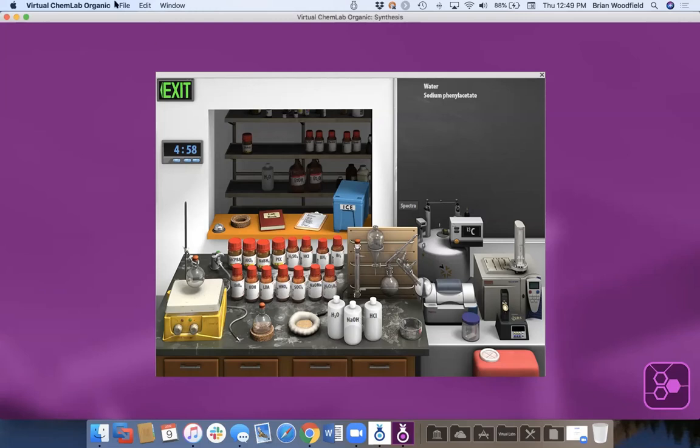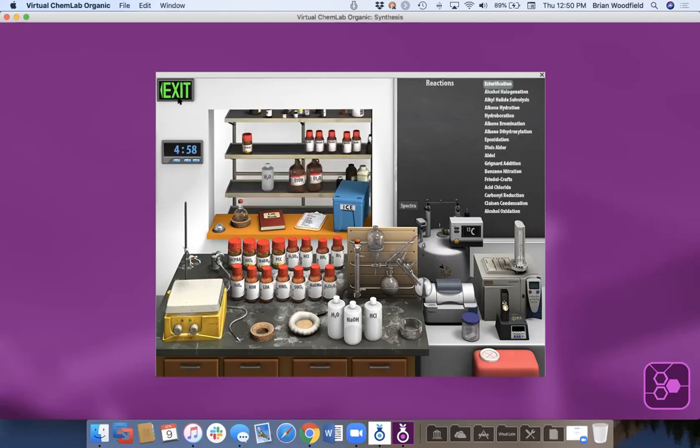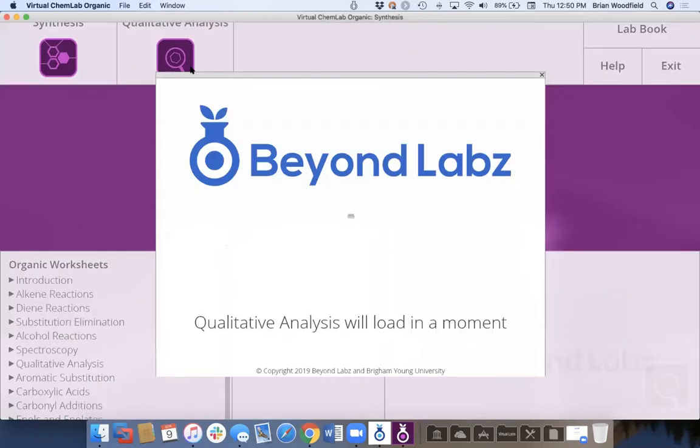Okay, good. These are great questions. So I'm just telling you what the constraints are that we work under. But in general, it's open-ended. Every lab is different in where we have to throw in those kinds of constraints. Like I'll show you the quantum lab. There aren't any constraints there. For example, we constrain where the equipment can go. Titrations, sometimes we constrain when you can add things, but mostly it's just for the calculation. All right, let's go do qual.